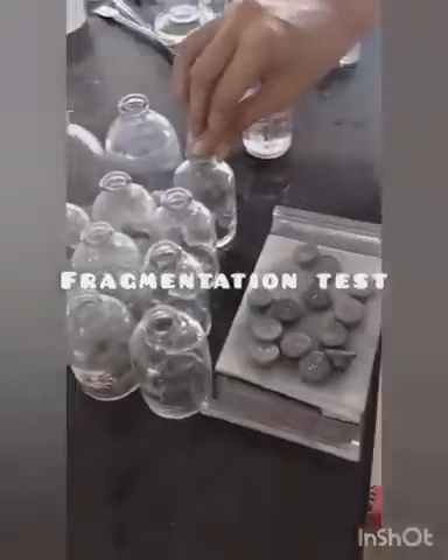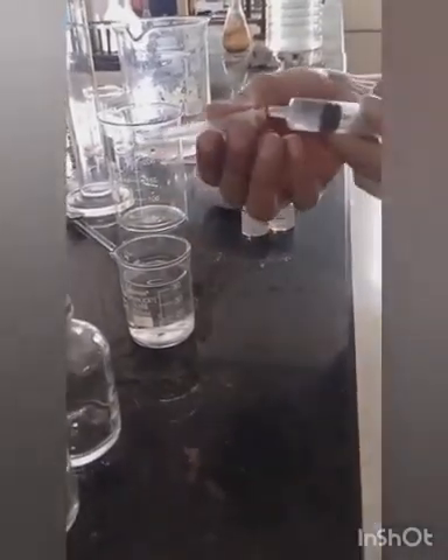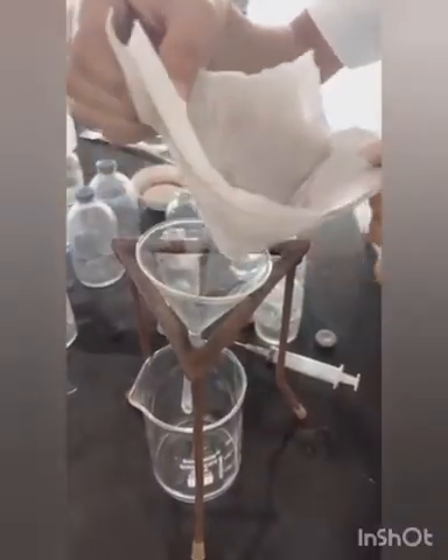The next test is the fragmentation test. Close 12 clean vials with the prepared closures. Using a hypodermic needle with external diameter 0.8 mm, inject 1 ml of water into the vial and remove 1 ml of air from the vial. Carry out this operation 4 times with a new needle. Pass the liquid in the vial through filter paper and check that the number of fragments is not more than 10, except in the case of butyl rubber closures where the total number of fragments is not more than 15.